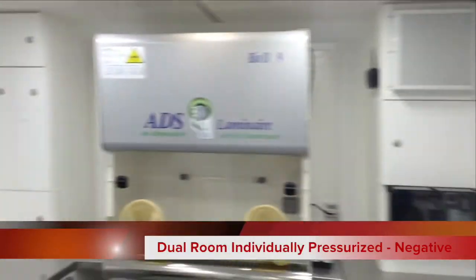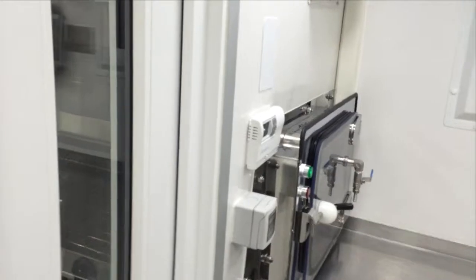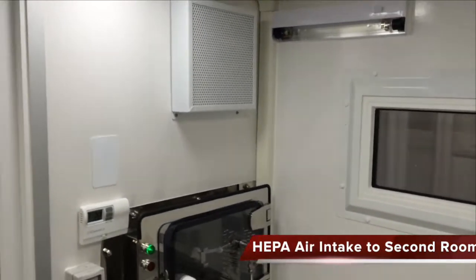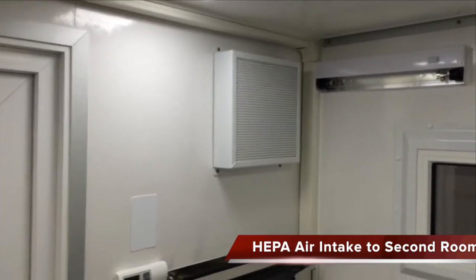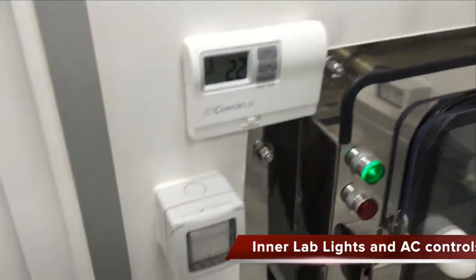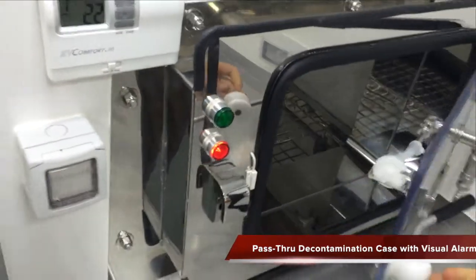We'll enter the lab room and shut the door behind us to give us negative pressure in this room. You can see here we have the pass-through for the HEPA air system. Thermostat, light switches, three-way. Here is the pass-through box with indicator light.